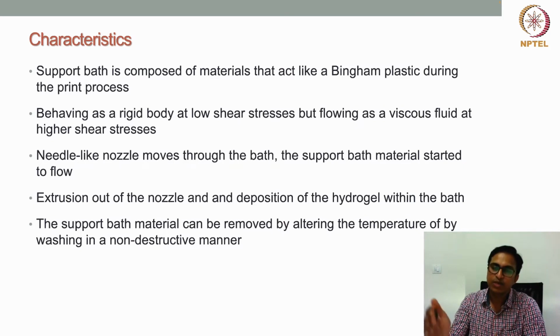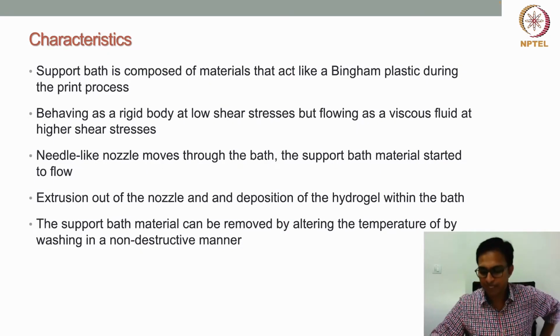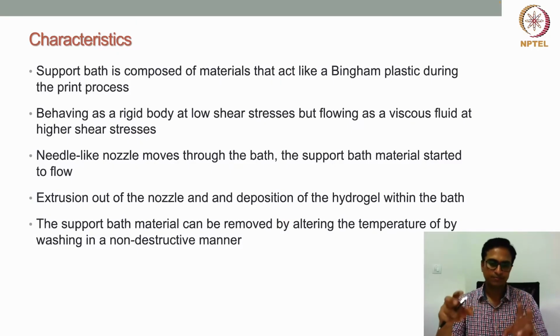So that kind of material we can very well use as a support bath material. Also, if the support bath material is water soluble, or soluble in buffer or media, then we can simply wash it in a non-destructive manner, and then it can be very well removed. So this is, in a way, the whole concept of 3D printing in support bath.